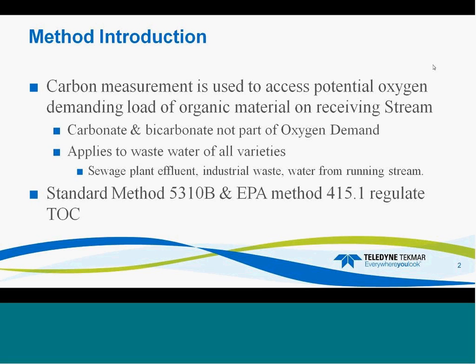In this webinar, we're going to discuss TOC using method 5310B and EPA method 415.1.